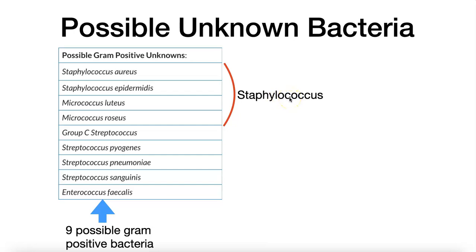If you recall, for that lab, each student chose an unknown bacteria that was identified just by a different color dot. By the end of the Staphylococcal lab, you should have identified that color dot, that unknown bacteria, as one of these 4 Staphylococcal bacteria.